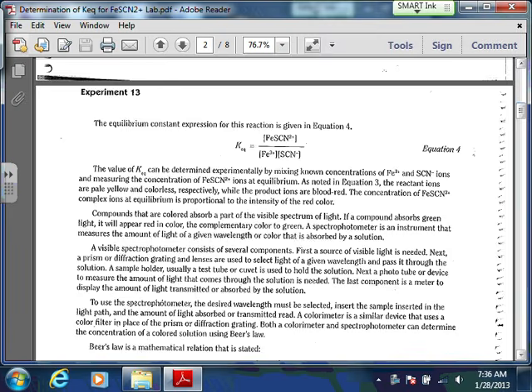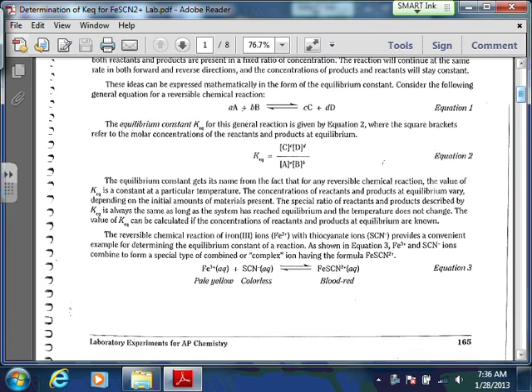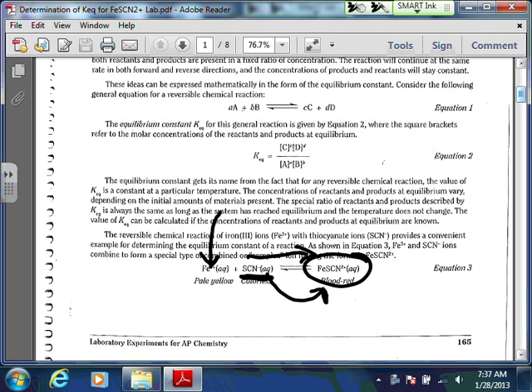Okay, and so what we're essentially doing with this, go back up to the equation. Okay, so what we are doing is adding a ton of this, which pushes the equilibrium pretty much all the way over here, so that pretty much all of this gets converted into this. That's a lot of arrows just then, but what that means is if we know the initial concentration of the SCN- that we're starting with, then that's essentially going to tell us the FeSCN2+ concentration.